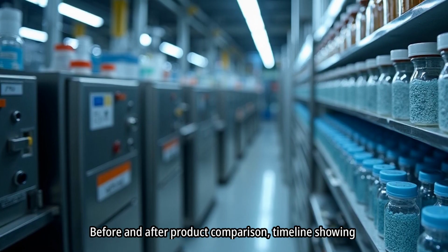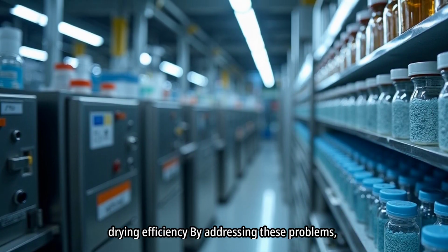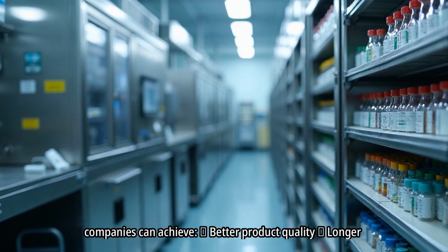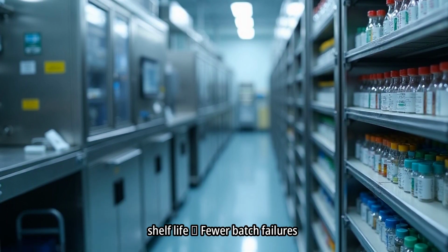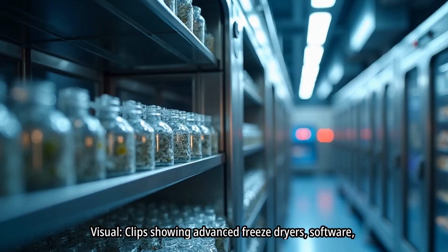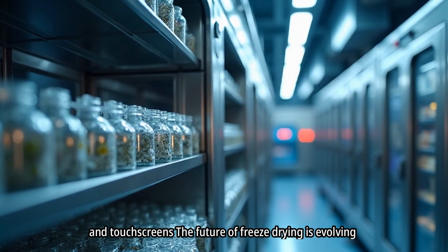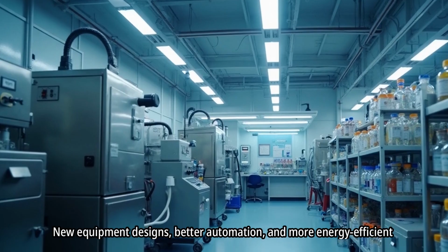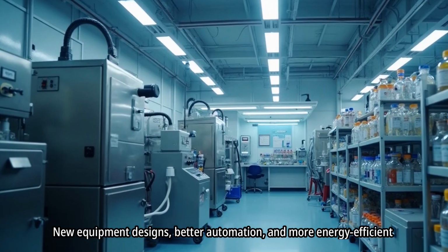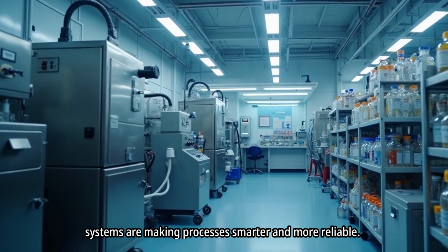By addressing these problems, companies can achieve better product quality, longer shelf life, fewer batch failures, and lower production costs. The future of freeze drying is evolving fast. New equipment designs, better automation, and more energy-efficient systems are making processes smarter and more reliable.